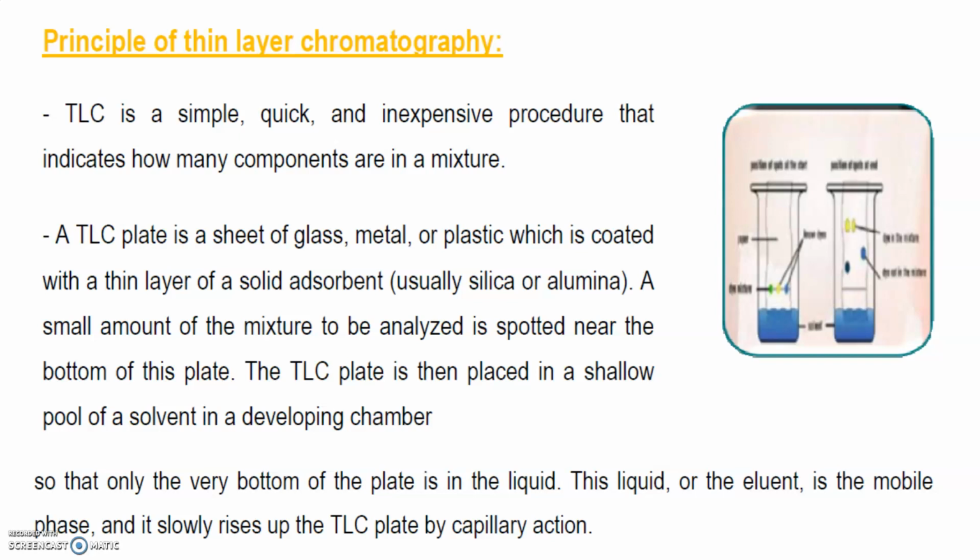Now friends, I will give a brief introduction about the principle of thin layer chromatography, because I know people forget after a long period of time, so I am going to remind you. TLC, thin layer chromatography, is a simple, quick and inexpensive procedure that indicates how many components are in a mixture.